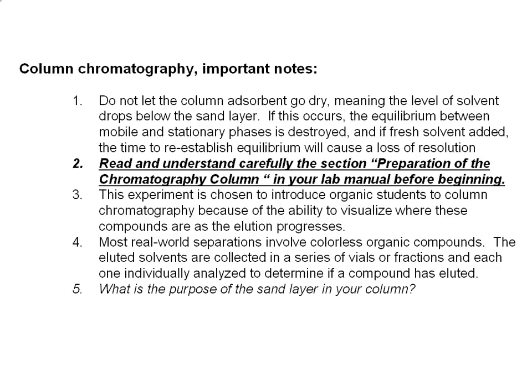Really read very carefully the section in your lab manual, preparation of the chromatography column. It's got some very important instructions. You want to keep your column as vertical as possible. You, again, don't want to let any part of it go dry. And the way that you load your reaction mixture onto your column, and the way you get it adhered onto the column through the sand layer is very, very important, and will help you get really good resolution.